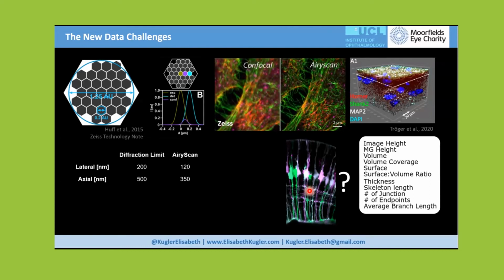But obviously, because in this setup of microscope you have a unidirectional beam path, the beam goes within the tissue. So one thing that you kind of need to keep in mind is that the first few layers have an incredibly high data quality and signal-to-noise ratio, but if you go within the tissue, you very quickly have a loss of information and really image quality.